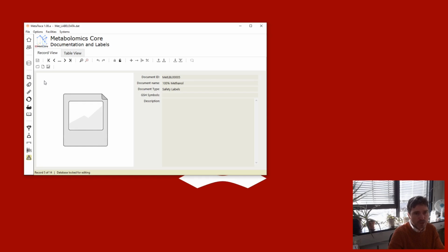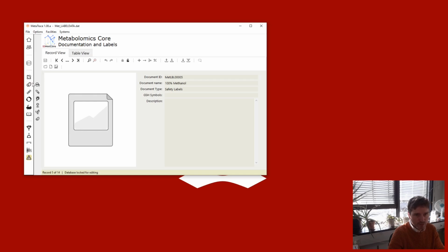Quite a useful feature, I think that would be in a lot of facilities, is a strain library. So if we click View Strain Database, we'll see it opens up these additional databases here, and these are different types of strain libraries. So we have an algal database, a bacterial database, a fungal database, a virus database, a plasmid host database, and also a cell line database.